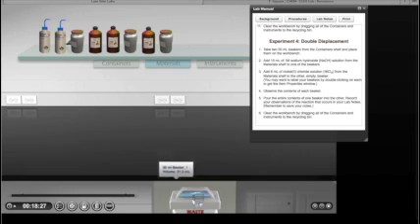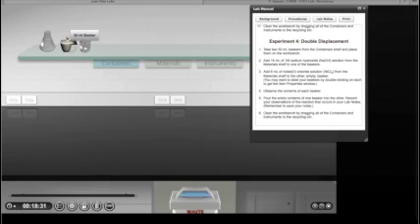This is a reaction between sodium hydroxide and nickel chloride in Late Night Labs. First, you go to the container section where you can find things like beakers and flasks and crucibles. And for this experiment, we're going to grab two 50 milliliter beakers to contain our solutions.